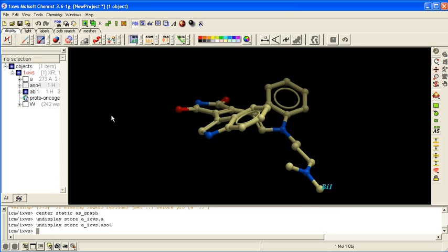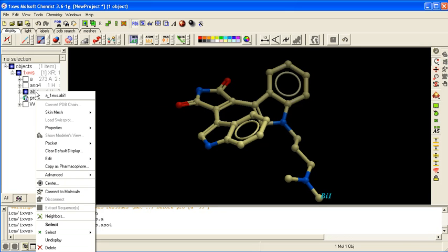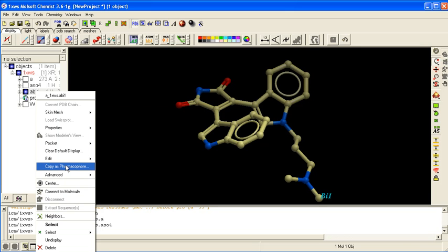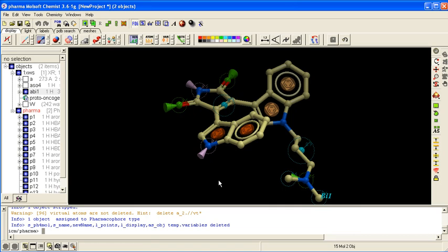To extract the pharmacophore points from this, you right click on the ligand name in the ICM workspace and say copy as pharmacophore. And then choose pharm centers. Click OK.